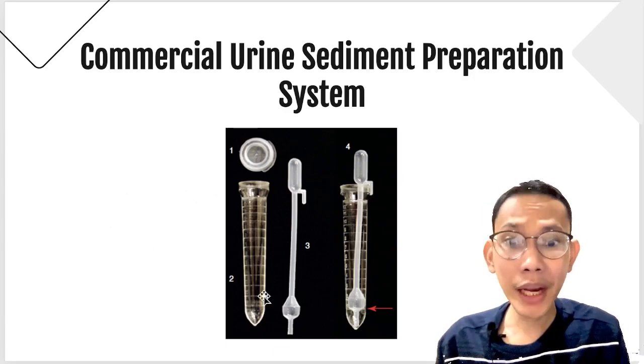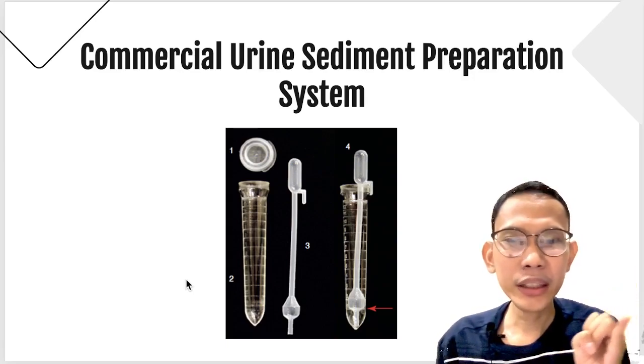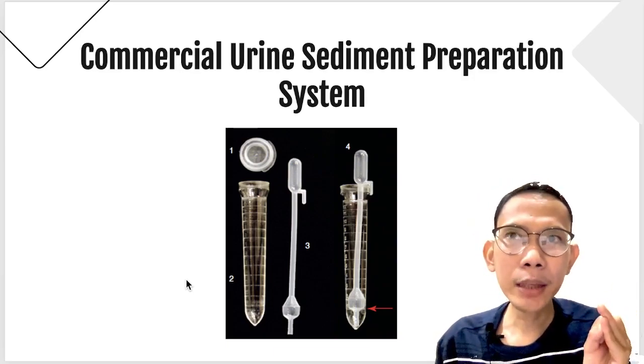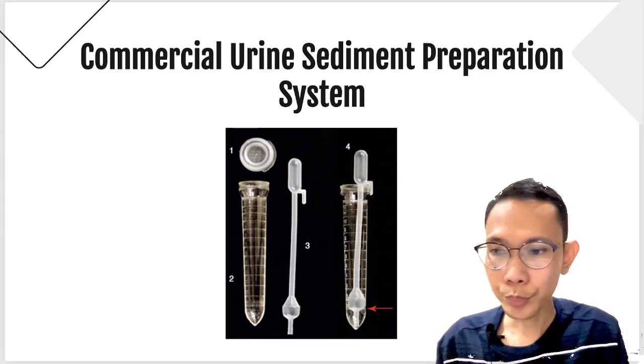But at least you have the idea that we have this kind of system, no? Personally, I was able to do my internship sa SMMC. Wala silang ginagamit na ganito, and sa work ko dati sa Digosloc, wala din kami ginagamit nito. Simple na talaga. Centrifuge lang yung test tube.